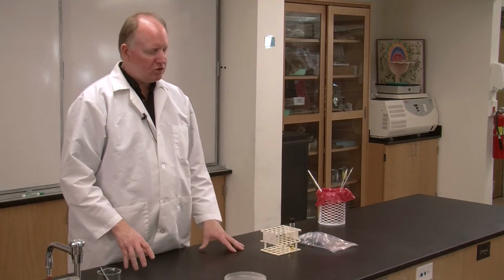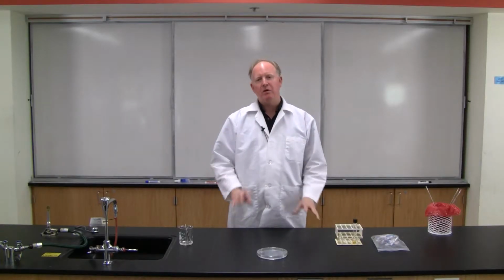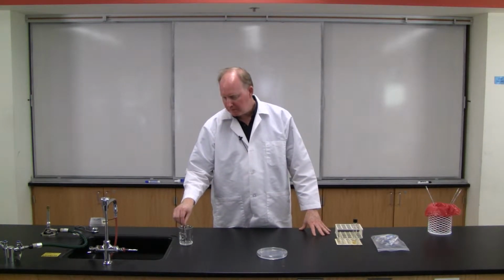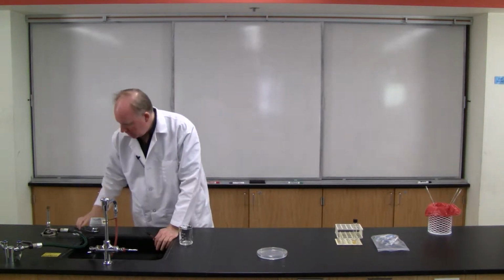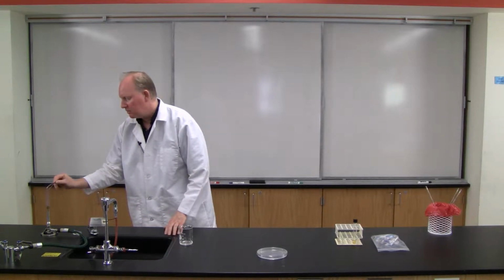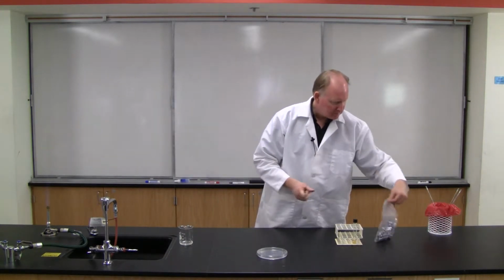And as with the chemical disinfectant disc diffusion test, it's very important to make sure that the discs are placed in such a way that they're as far apart from each other as possible. So I'll demonstrate that as we go along. So we're going to use our forceps, and we're going to have to dip them in alcohol and briefly flame them before we get our first antibiotic disc.